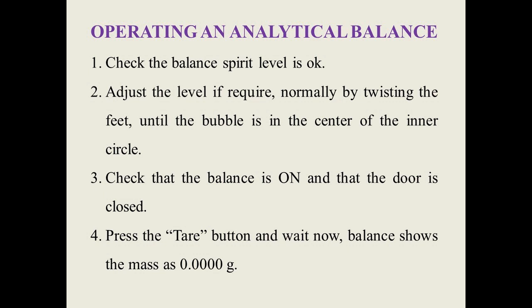Check that the balance spirit level is okay. If the spirit level bubble is not at center, then adjust the level. Level may be adjusted by twisting the adjustment feet until the bubble is in the center of the inner circle. Check that the balance is on and that the door is closed.